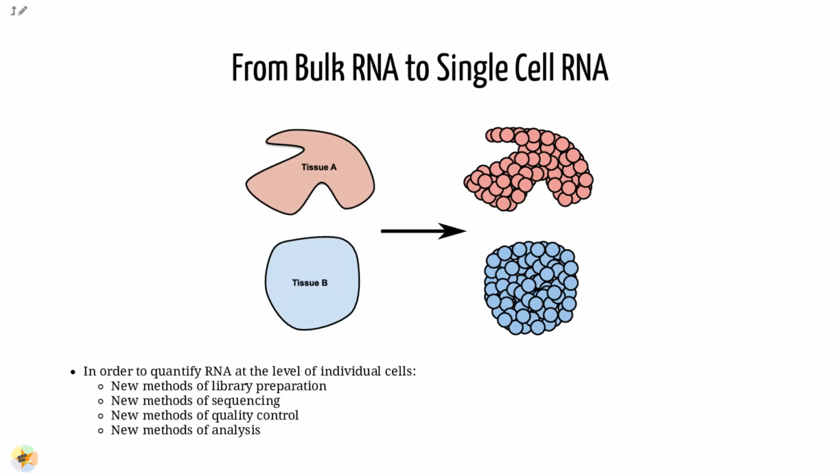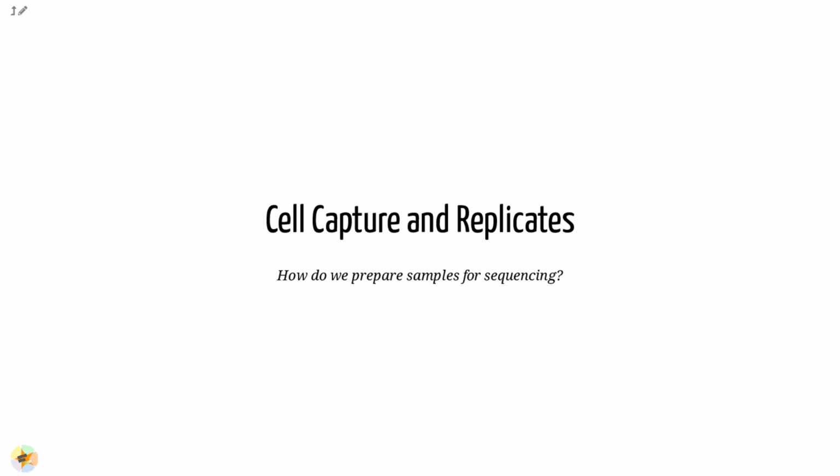New technologies means new methods and techniques to harness the new features that come with them. Single-cell RNA-seq data requires different means of library preparation, sequencing, quality control and analysis. For example, how are cells captured and sequenced?